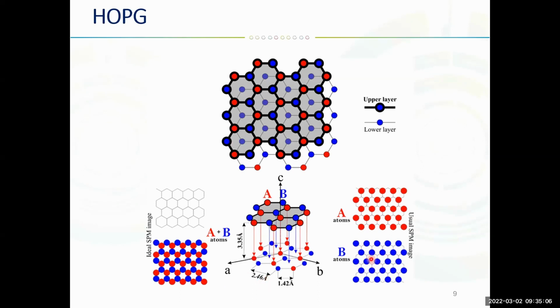The distance between these imaged atoms is about 2.5 angstroms. And in the hexagon, the distance between two neighboring atoms is 1.4 angstroms. So the atomic pattern normally observed in most SPM images is bright spots that originate from only 3 carbon atoms out of the set of 6 in the honeycomb.